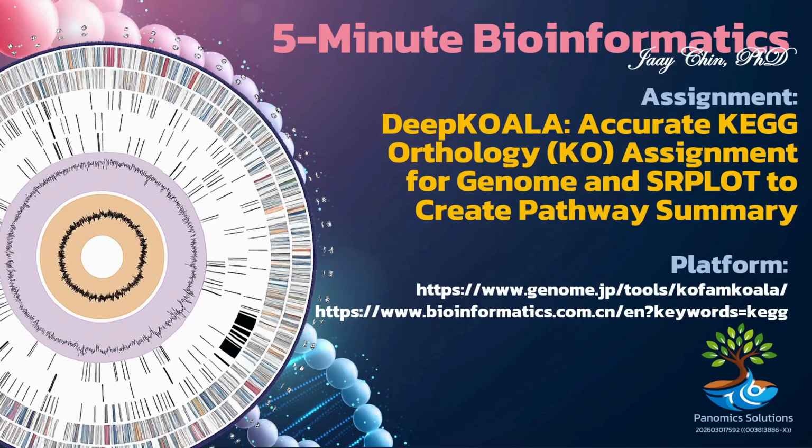In today's tutorial, we are stepping things up a notch and diving into some slightly more advanced bioinformatics analysis. We're going to run through two powerful tools in this workflow. First, DeepKOALA, which gives us accurate KEGG Orthology, also known as KO assignments from genome data. And then, we will jump into SRPlot to generate a clean, publication-ready pathway summary. So if you are ready to turn raw sequence data into meaningful biological insights, let's get started.